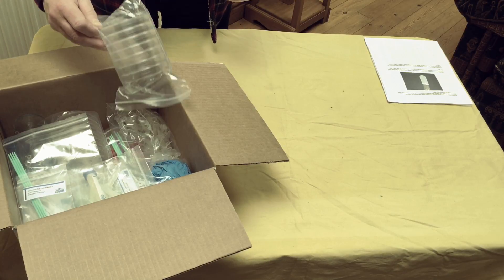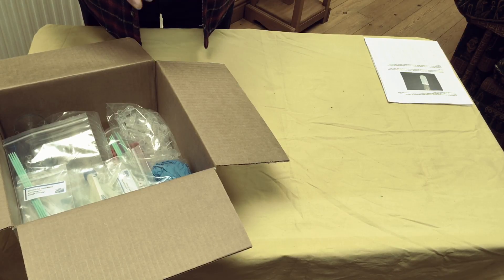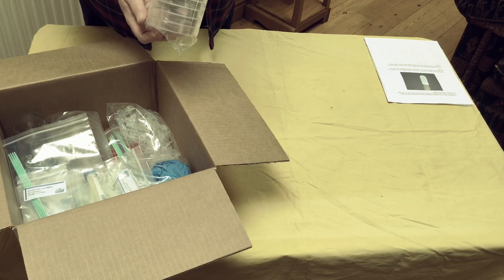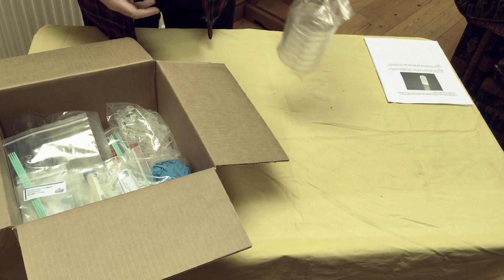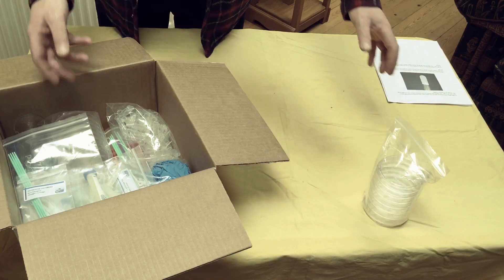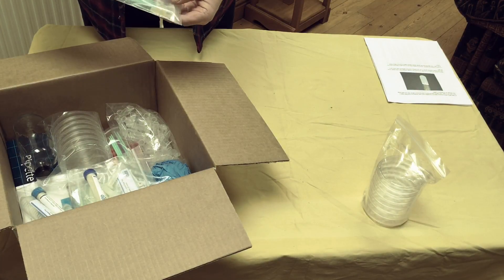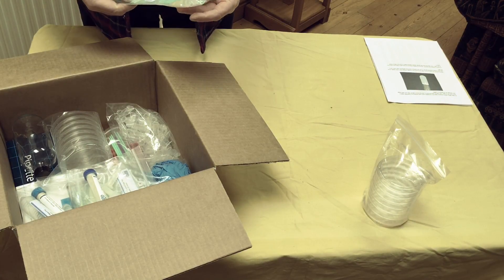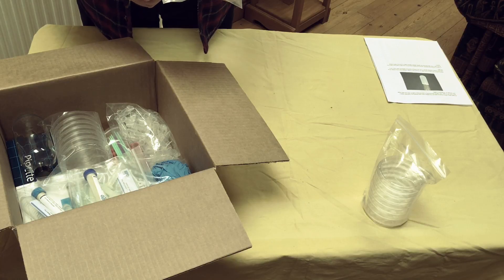Then we've got some petri dishes, although I've learned that they call these petri plates, but with lids on. Some what seem to be kind of stirrers or something. And what's this?